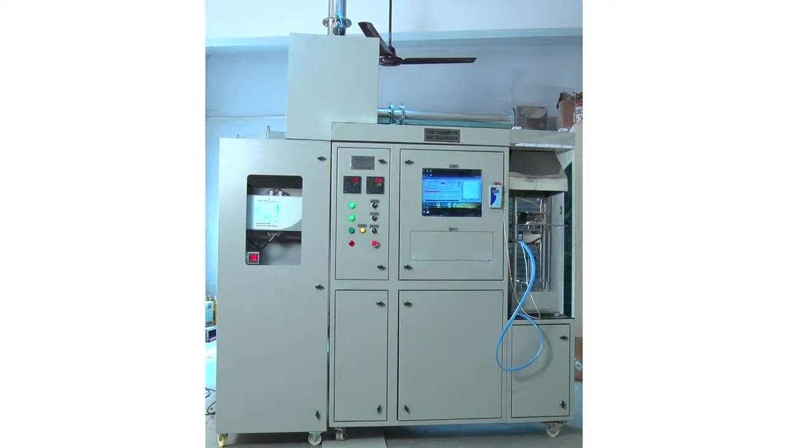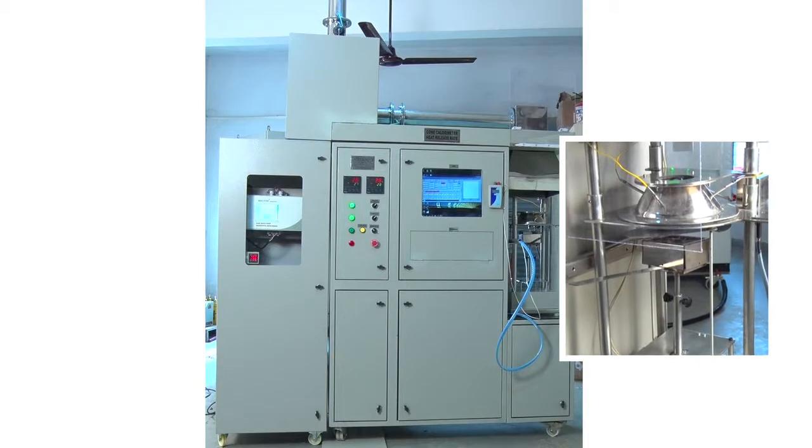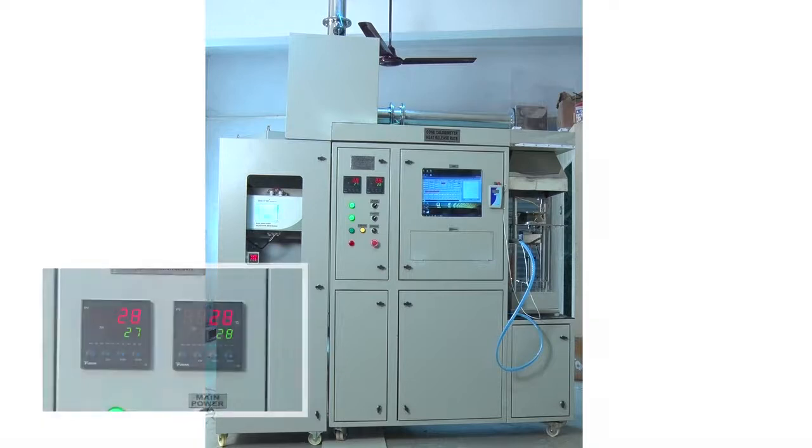The Cone Heater Test Bench has 3 main components. The first is the Cone Heater, which is a special type of heater made as per ISO standards. There are also 3 temperature sensors which display the temperature readings.